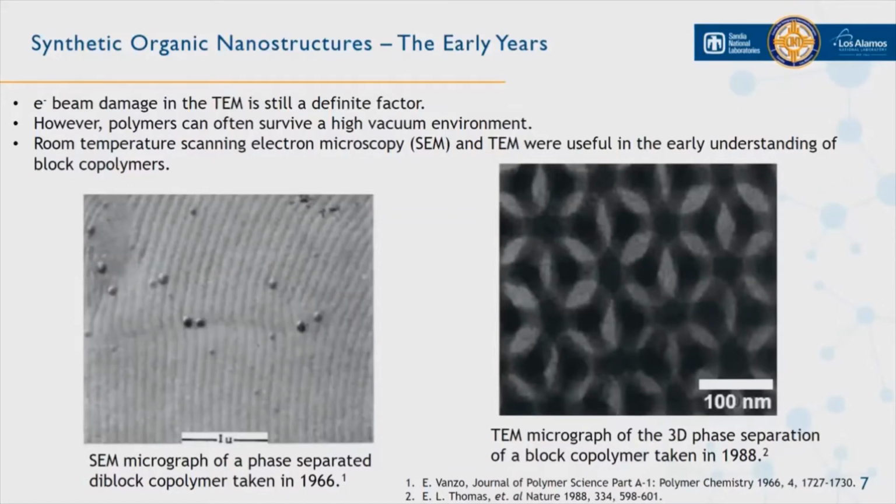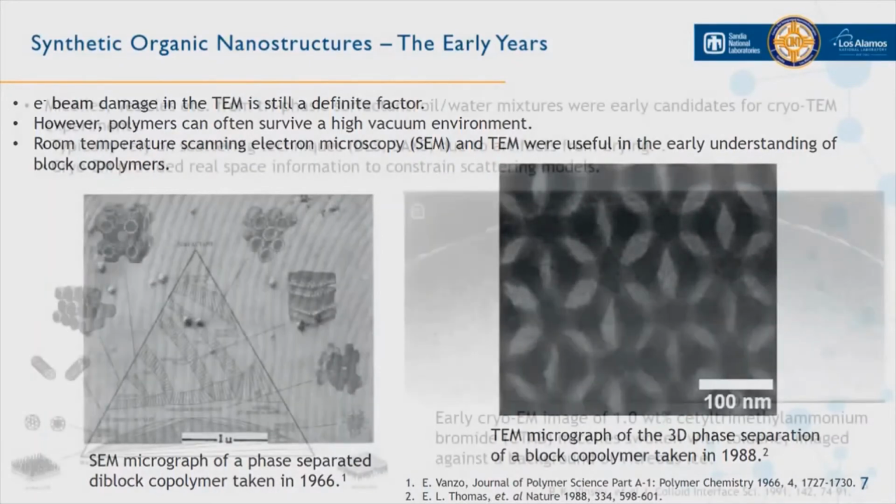So while providing good insight, these structures are bulk and stable at room temperature, but polymer science also produces higher order architectures that can be hydrated or solvated and dispersed in solution. And so this requires novel characterization techniques, since preparing for conventional TEM will introduce artifacts, hence cryo-EM.